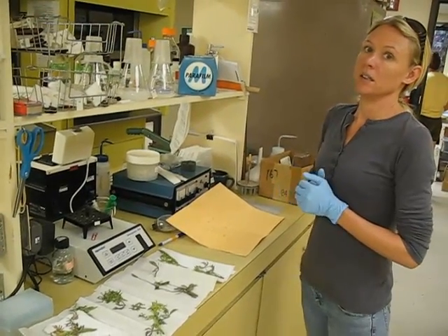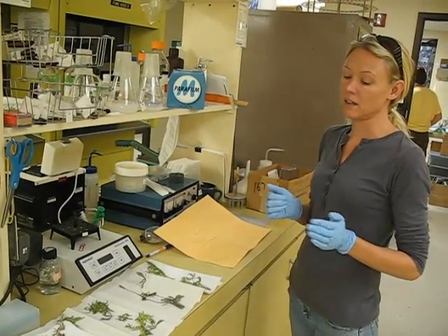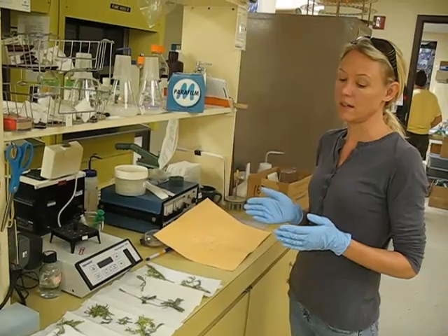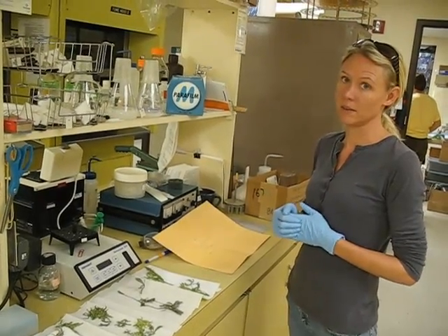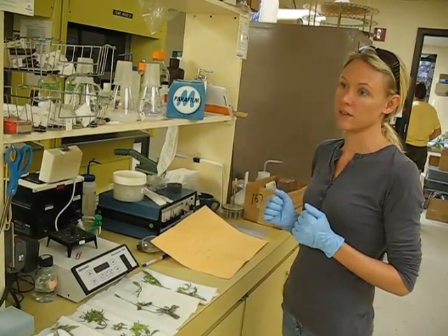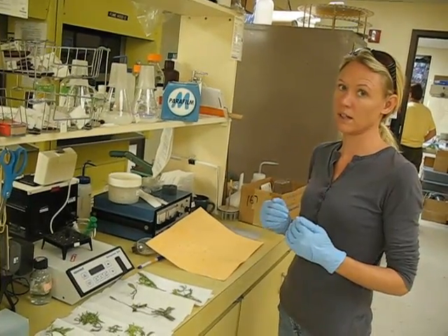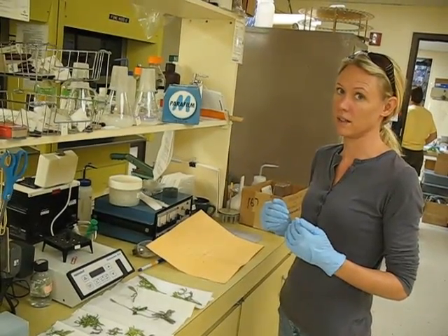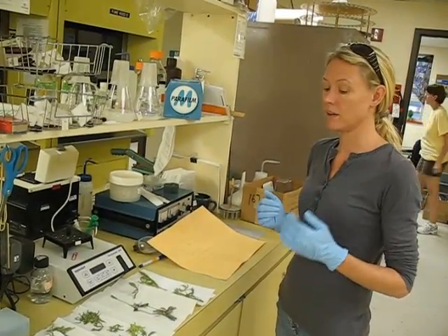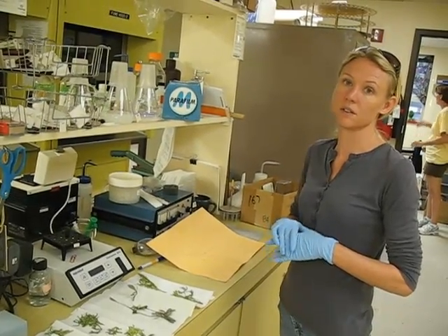How long is it going to take before you get a result from all this? By the end of the day, if not this afternoon, we will have the DNA extracted from the plant. Then we have to run aliquots of the DNA out on a gel, clean up an aliquot of the DNA with a DNA cleanup kit, and run those out on a gel. By tomorrow we should be able to set up PCRs.